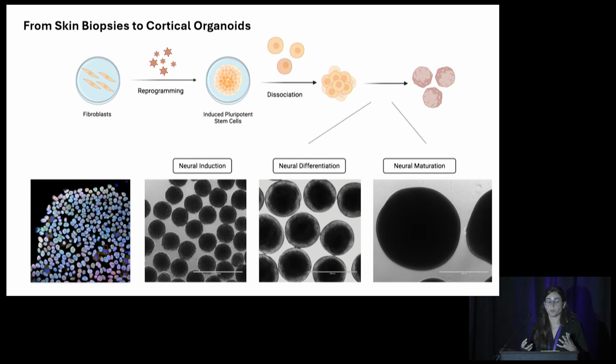Makes them pluripotent. So once we guarantee that our colonies are stem cells, really, now we can start the differentiation process. We induce these stem cells to become neurons, and not just neurons in our case. We actually induce them to recreate the neurodevelopmental process. So they will basically restart the brain development.